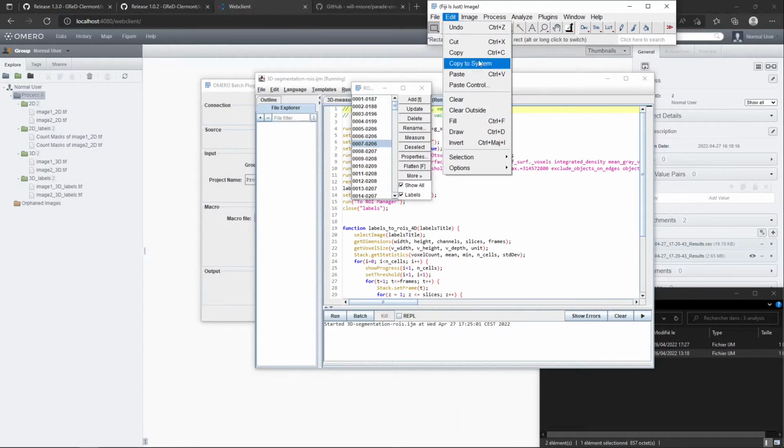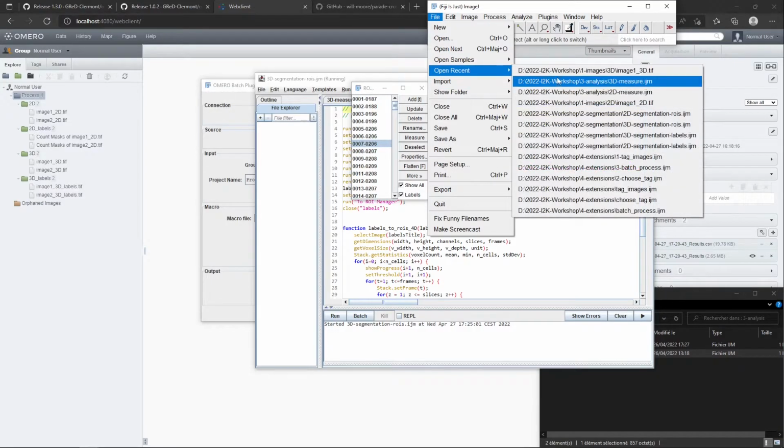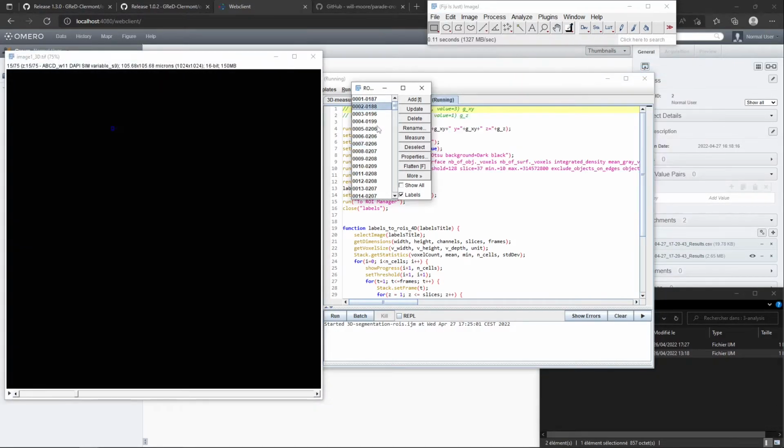I will reopen the image with the original intensity. So here we have that.